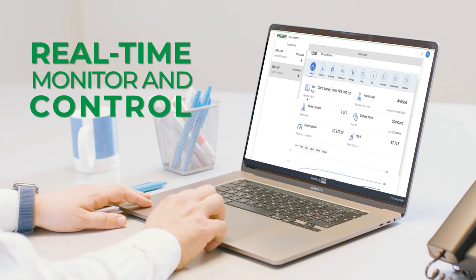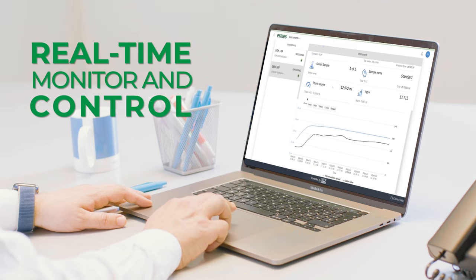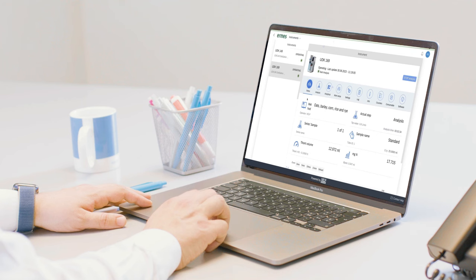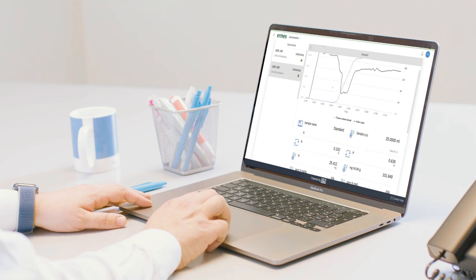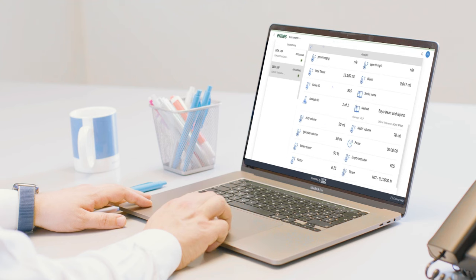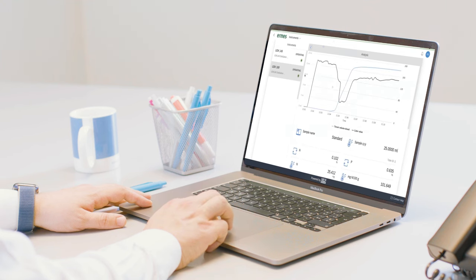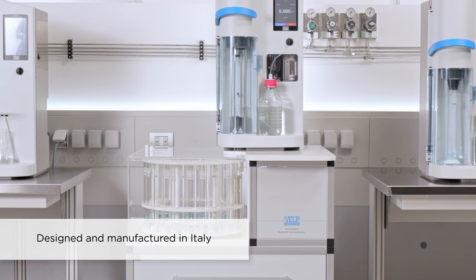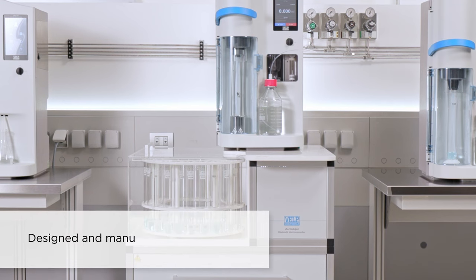Access from a PC, smartphone or tablet to manage multiple instruments, monitor analysis data and instrument working conditions and receive immediate event and alarm notifications. VELP-UDK169, the premium Kjeldahl distillation unit designed just for you.